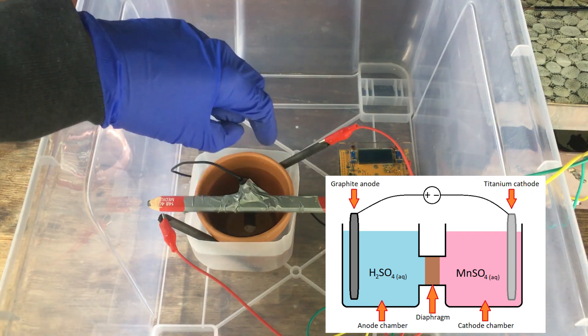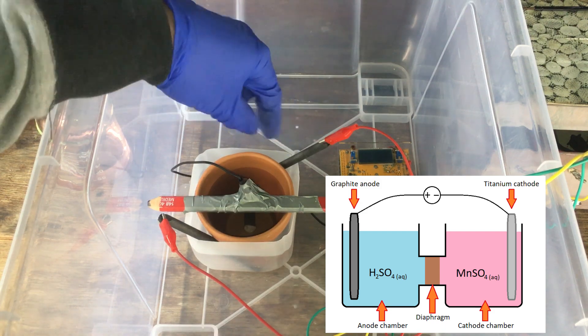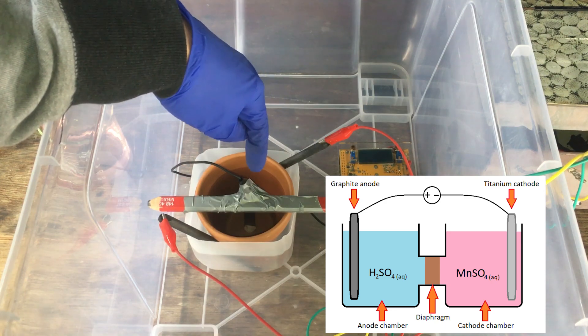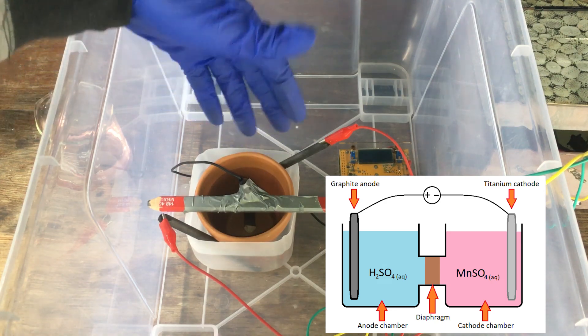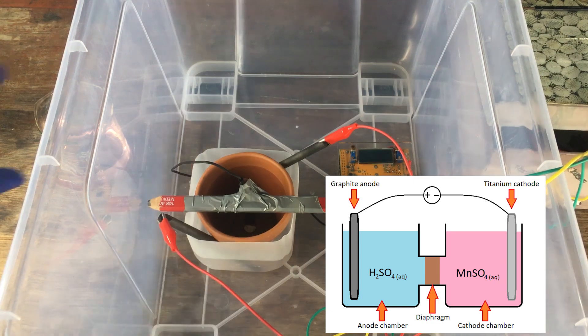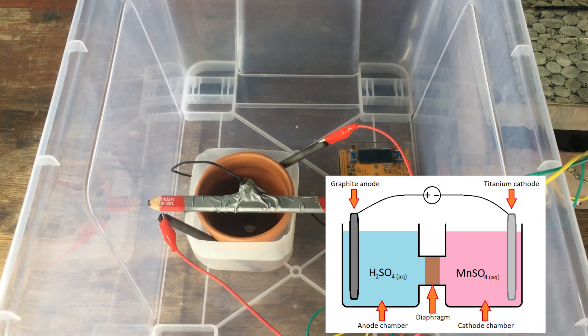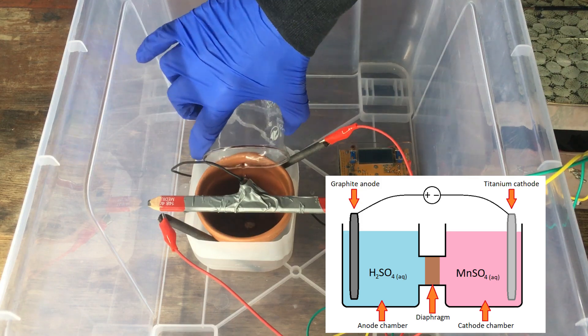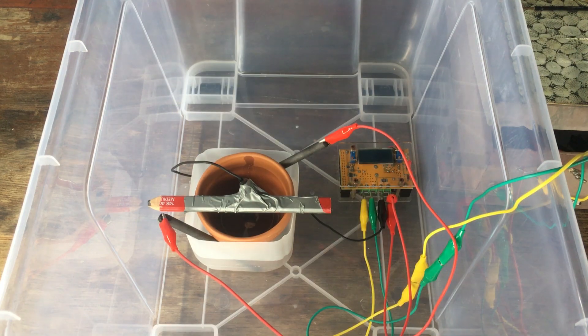This prevents manganese ions from being oxidized on the anode to form manganese dioxide, since we're only filling the cathode compartment with the manganese sulfate. So, adding the manganese sulfate solution now to the cathode compartment. And turning on our electrolysis.